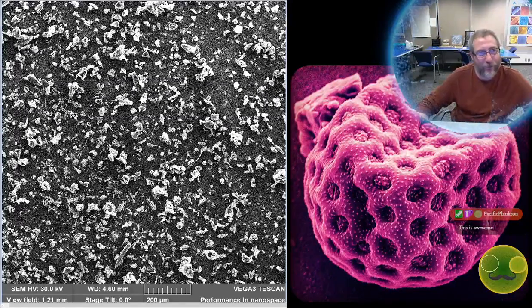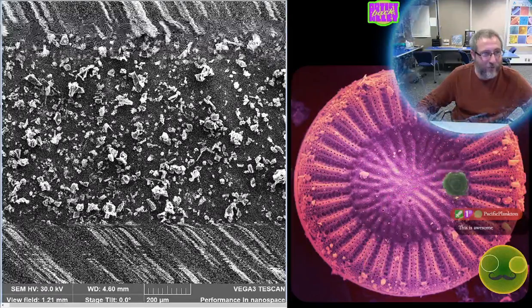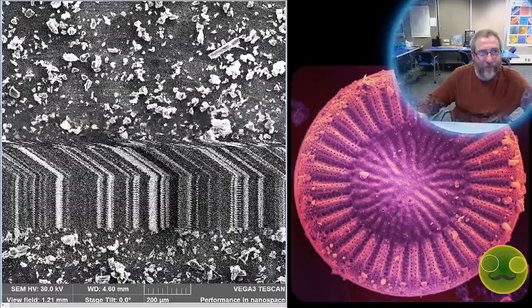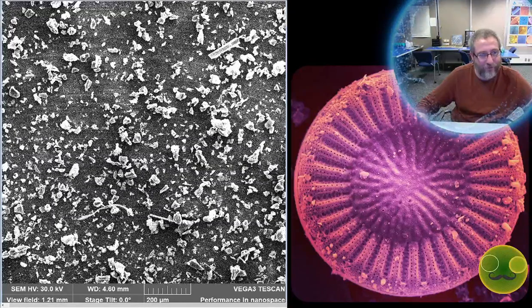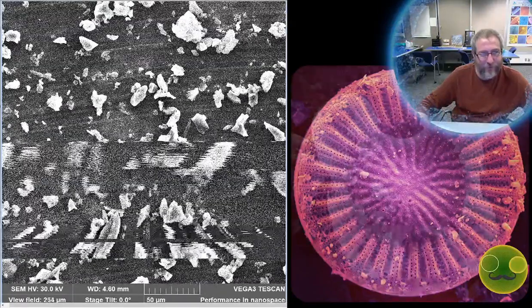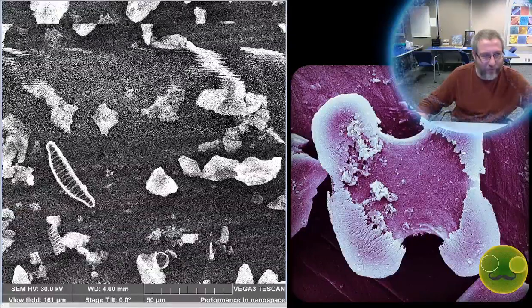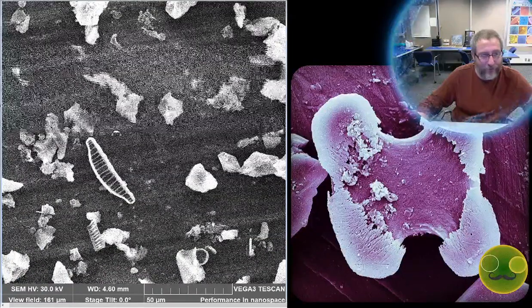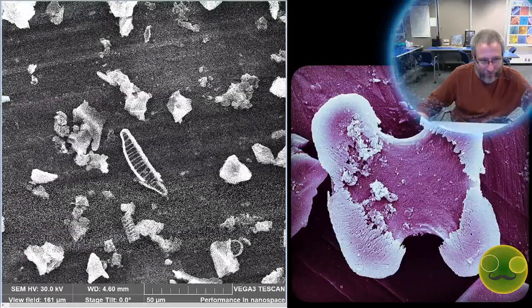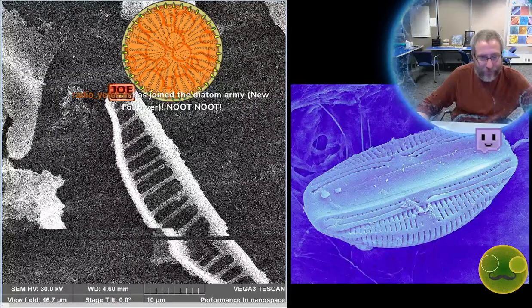Diatomite, right? Because we put ite at the end of things that are rocks. That's usually like meteorite, right? It's like a type of rock made out of a meteor. And diatomite is the same kind of word. It's like a rock. So these were collected in the outcrop as rocks, basically. We just scraped a little bit of them with a needle-like thing to scrape some of them apart, and then magic, diatoms, tiny algae that normally in this case would have been living in an ancient lake, and we have them living in, well, dead, in our samples. They died in our samples.